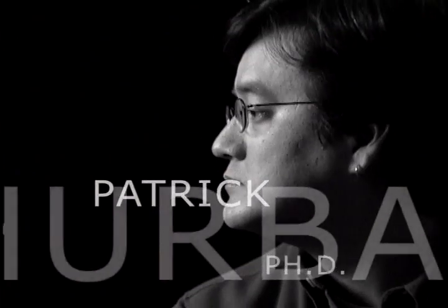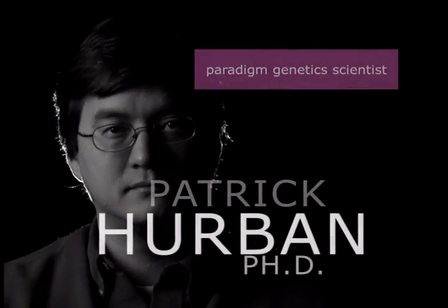I think that you can point to a number of really core technologies developed over the past decade that have really revolutionized the way that biologists understand life. And I think the next one on that list has to be microarray technology, because it allows us to understand organisms at a level totally different than we were able to before.